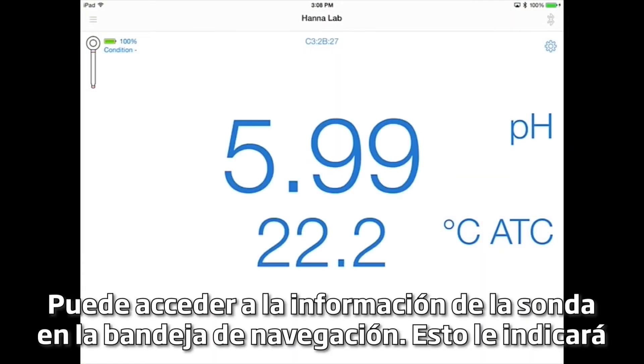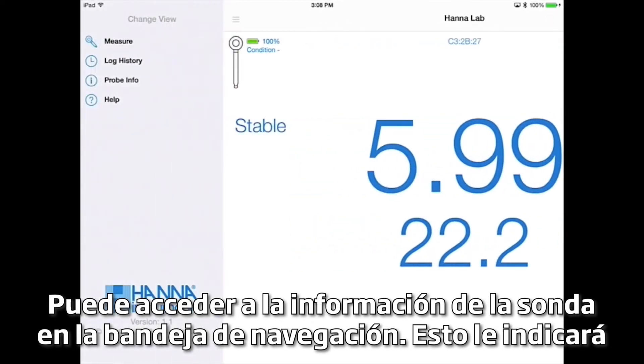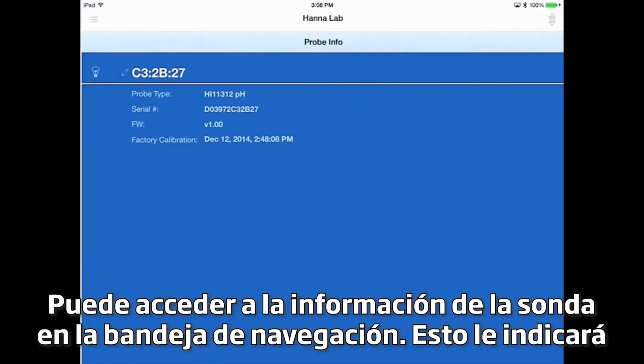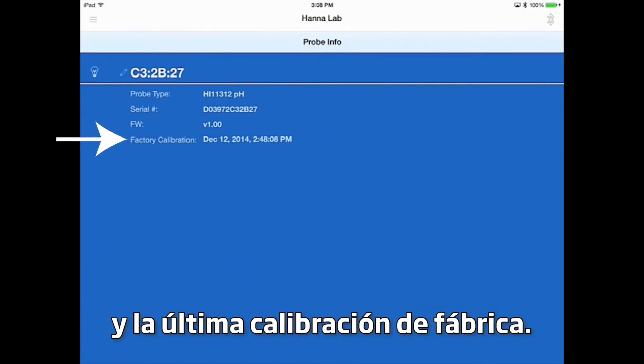You can access the probe information in the navigation tray. This will tell you the probe type, serial number, firmware version, and the last factory calibration.